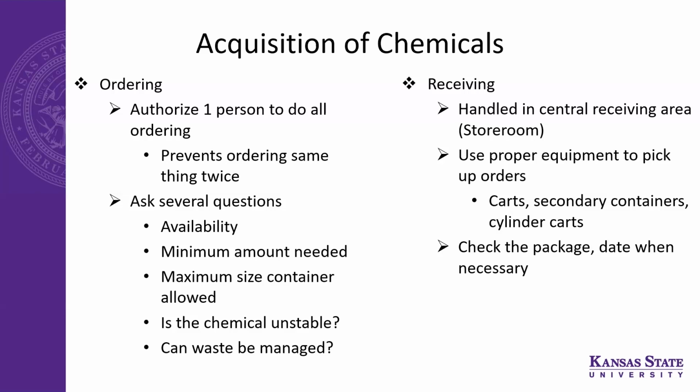And of course, whether the chemical is stable and can waste be managed. If you are not sure after going through the SDS, if you still have questions, the best people to reach out to would be the EHS. Then they'll let you know. For example, sometimes they may not be able to dispose of the chemical right away if you contact them. So that's why it's important to consider whether the waste can be managed.